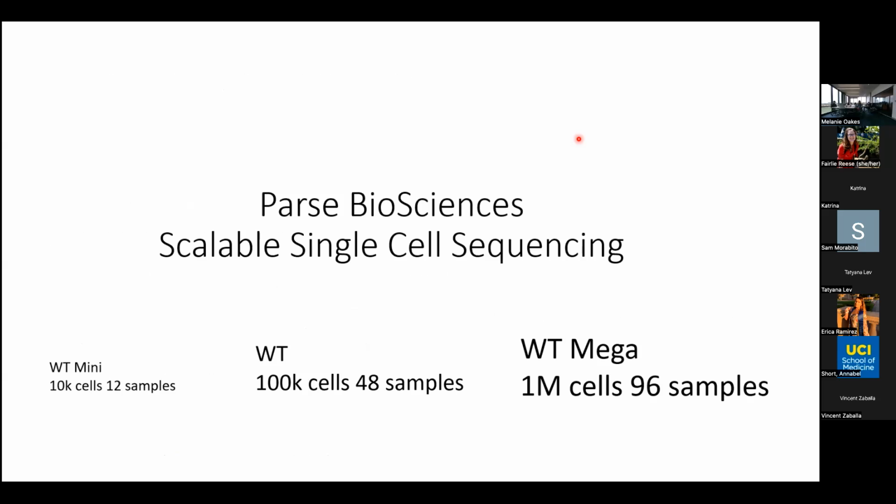There are 2 different ways currently that we're doing it in the lab. I sent around the cartridge for 10X, but the first one I'm going to talk about is Parse Biosciences, which is the equivalent of SplitSeq. It's SplitSeq that's been commercialized, and they can go up to 1 million cells. Which would stress out the analyst, yes.